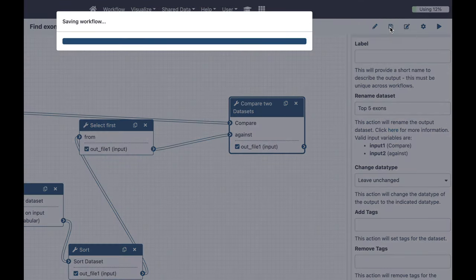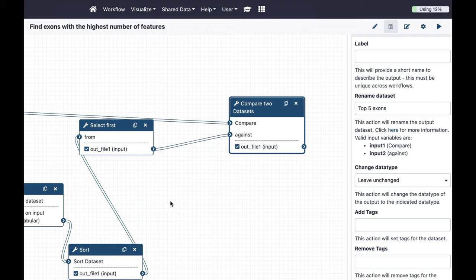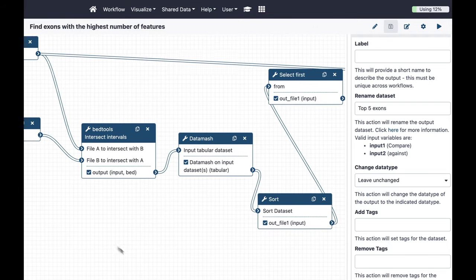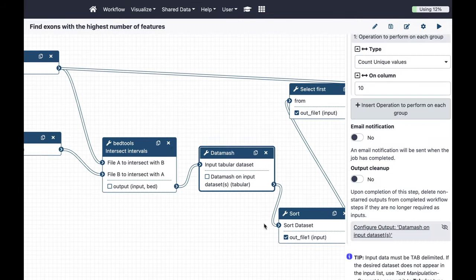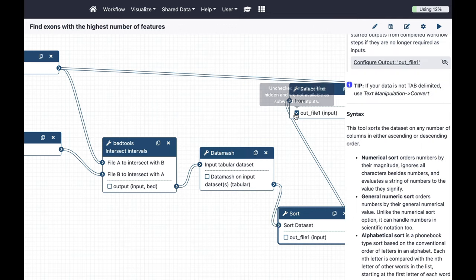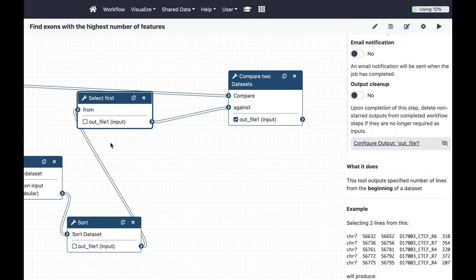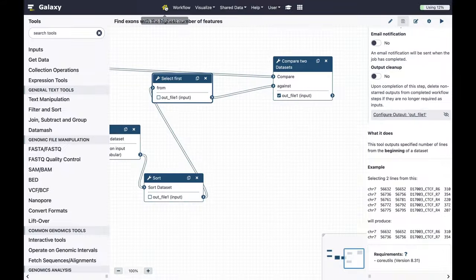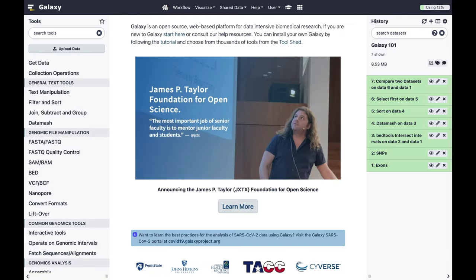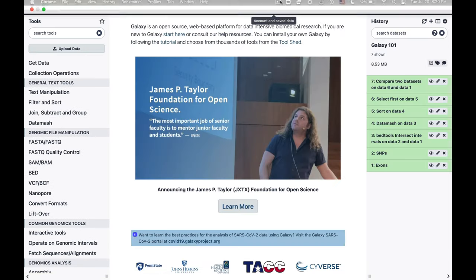Don't forget to save. One other thing I can do here is uncheck the checkboxes so the intermediate datasets won't appear in my history — they'll be hidden, making the history easier to review. Let's save it, go back to Galaxy, and create a new history.